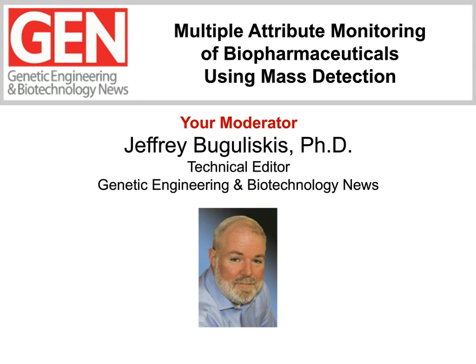Advances in technology and measurement sensitivity have allowed for the development of equipment that employs the use of both UV and mass data in implementing multiple attribute method analysis that typically targets downstream processes, but is increasingly being expanded to QC assay protocols. The demand for cost-effective and user-friendly mass detectors for routine monitoring of multiple biotherapeutic attributes is on the rise. Let's meet our speaker for today's webinar, who will discuss the implementation of multiple attribute methods assays and how they can aid production analysis.